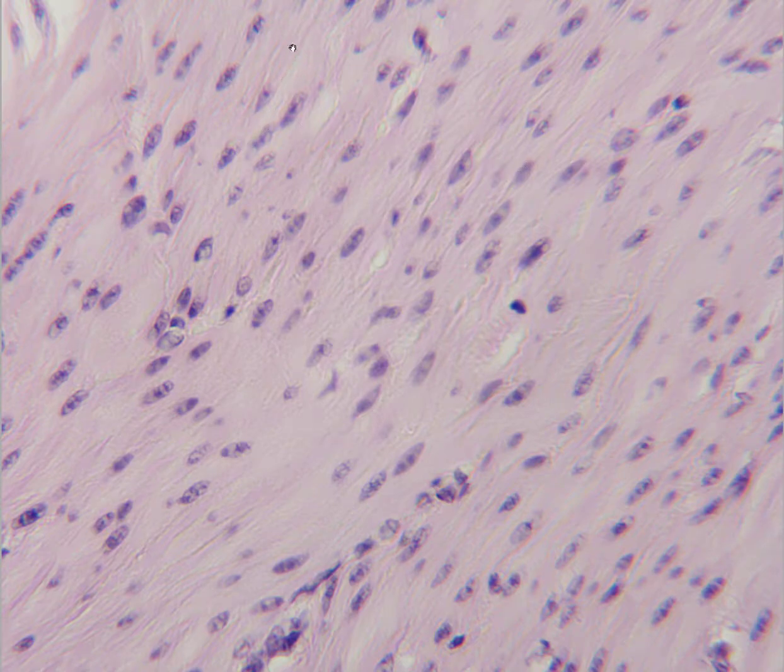And so this is actually cells now. This is not some kind of connective tissue, whereas when we looked at the connective tissue, the pink things are much longer, and they're collagen bundles, and the purple things that are included in between them are going to be the nuclei of the fibroblasts. In this case, you can see this is smooth muscle because the nuclei are inside the cells, and they're a bit different shape. They're not quite as elongated. And you can also see a little bit of the cell border here. So that is our smooth muscle.